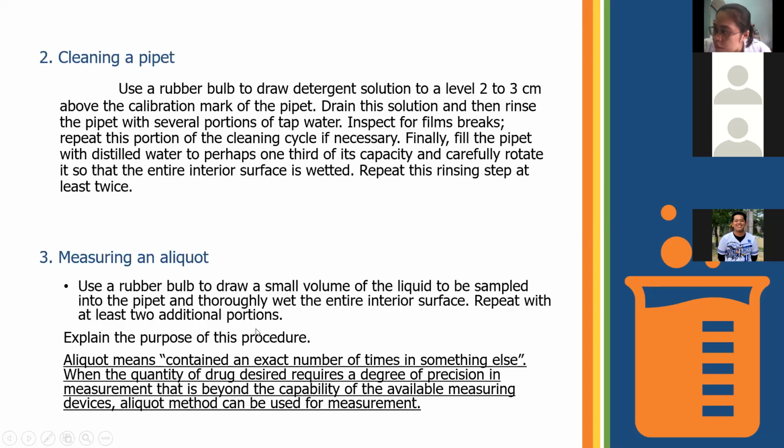So why do we need to clean a pipette? A pipette should be cleaned regularly for us to guarantee that there's no contamination, and para po sa ato ang safety.